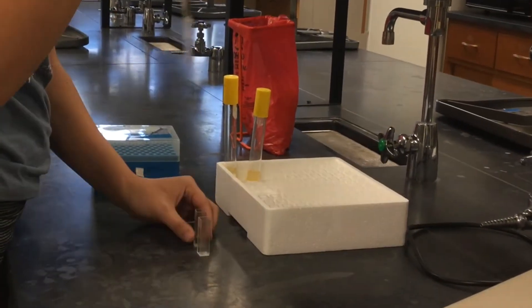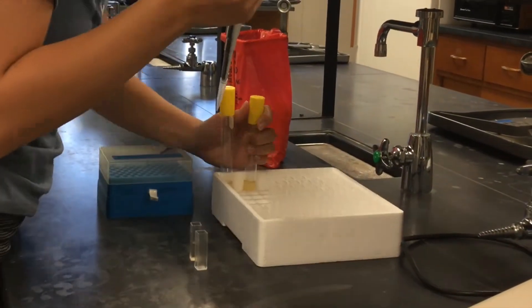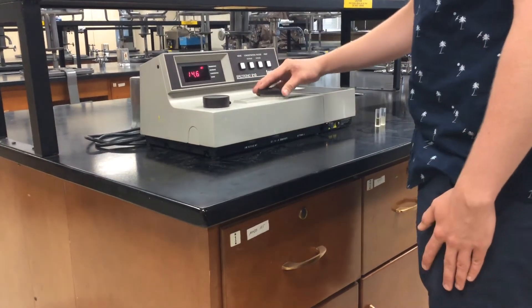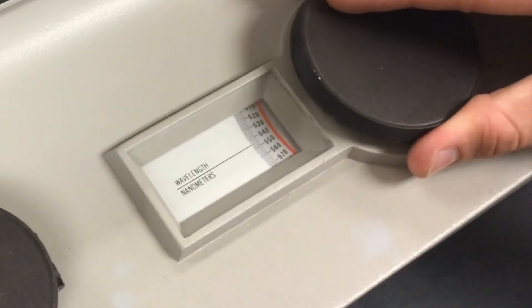Prepare your samples by micropipetting the solutions you want to analyze into your cuvettes. Adjust the wavelength control knob to the desired starting wavelength. In this case we will be using 550.